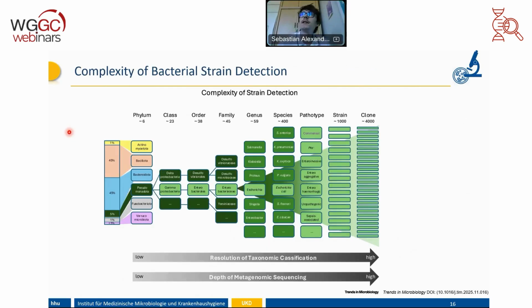The question then arose if it's possible that some of the bacterial species the patients had in their microbiome before transplantation can survive this process. So, for example, a patient has an Escherichia coli before transplantation, then we can detect this E. coli during the leukopenia phase, and then again it has an Escherichia coli in the reconstitution. Is this the same? Not only the same species, but the same strain as before.